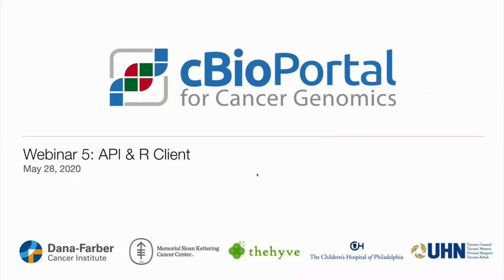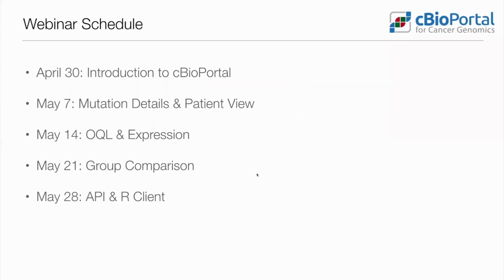Today we'll be presenting webinar 5, the API and the R client. So we've had 4 webinars so far, every Thursday. The previous 4 were more focused on using the website, and this is really more for advanced users that would like to programmatically access the data in the website. And this is the last webinar for now.